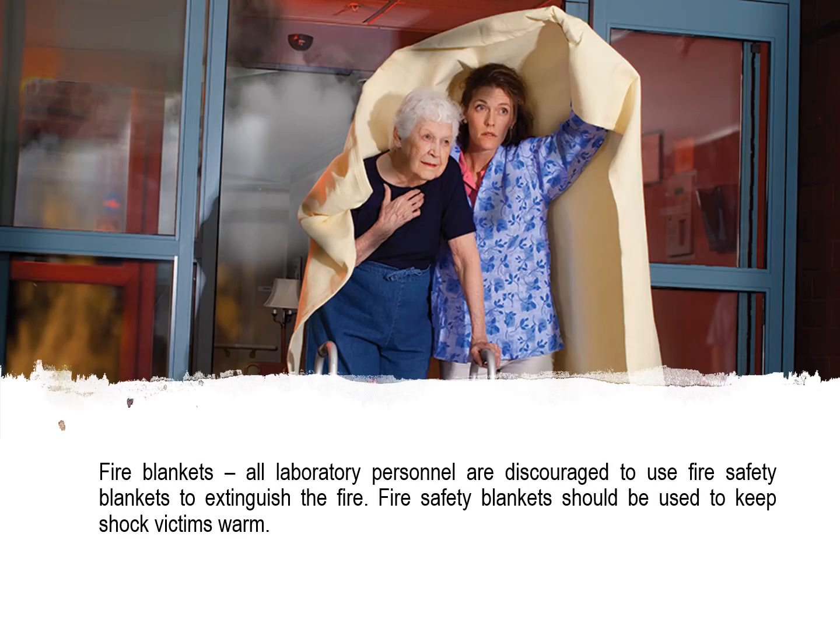Then we have our fire blankets. It says here that all laboratory personnel are discouraged to use fire safety blankets to extinguish the fire. Fire safety blankets should be used to keep shock victims warm. Okay, so that's the purpose of our fire blanket. It's not used to put off fire inside the laboratory, because we have our fire extinguisher. So the main purpose of using the fire blanket is to give comfort to our fire shock victims.